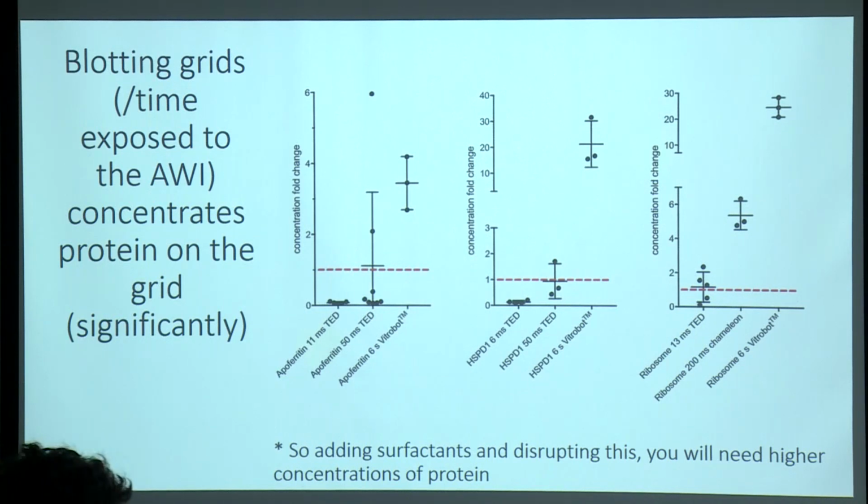And this is really fascinating to me because as somebody that works in a cryo-Electron microscopy facility, one of the most common questions that I get when people first come to the facility is how much protein do I need, and what concentration does it need to be at, and how pure does it need to be? And it's always very frustrating for me because I can never give a clear answer to this.